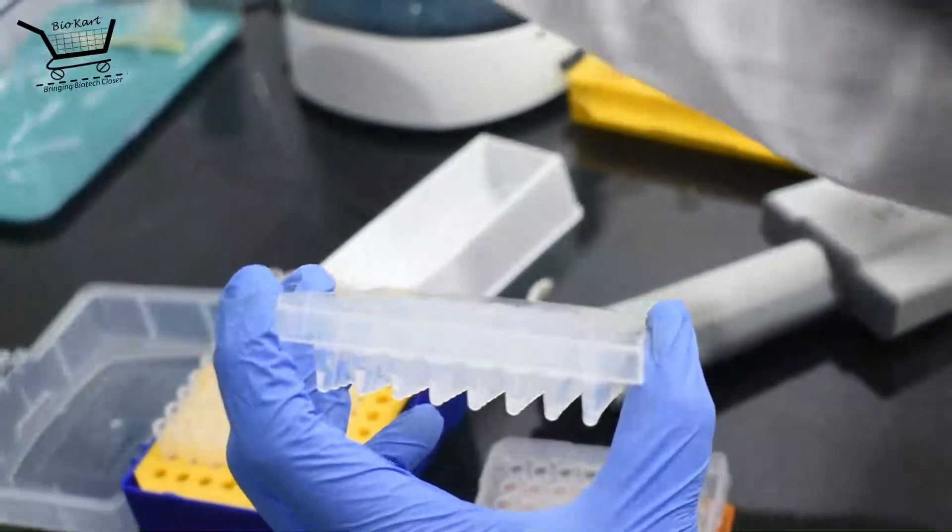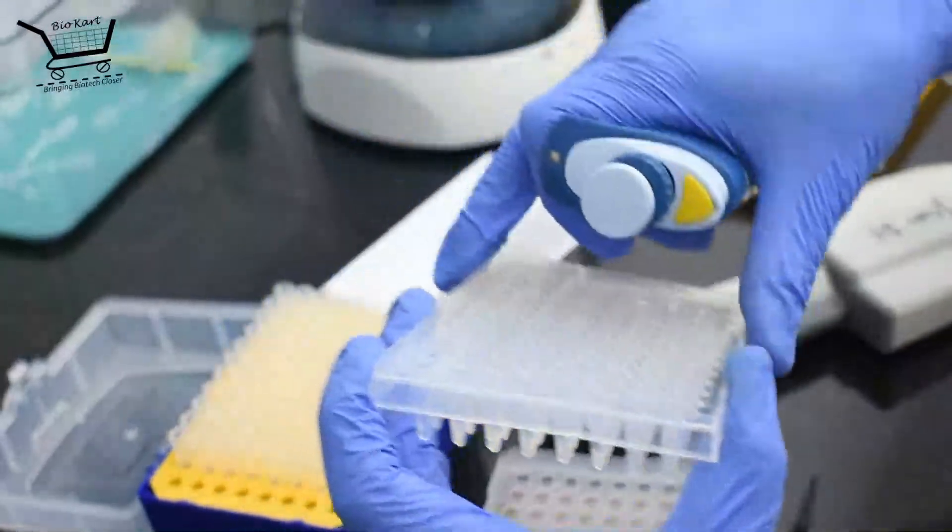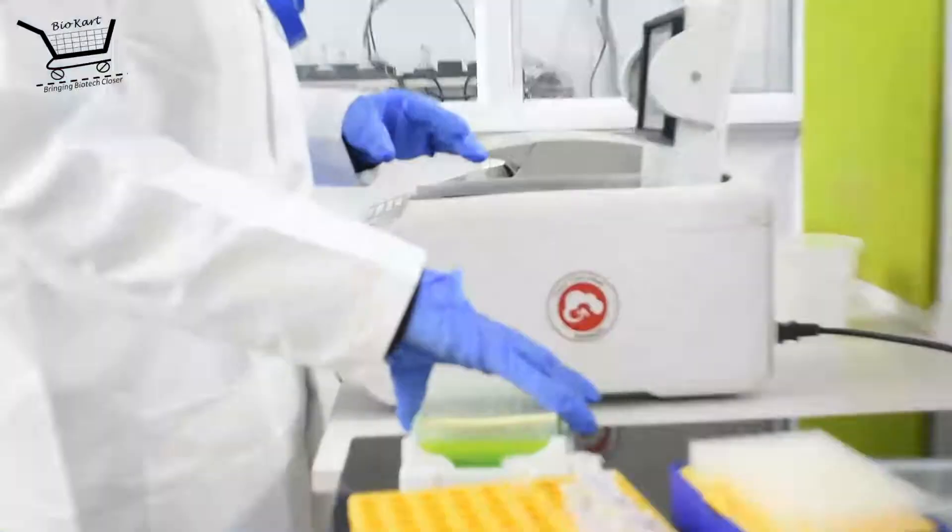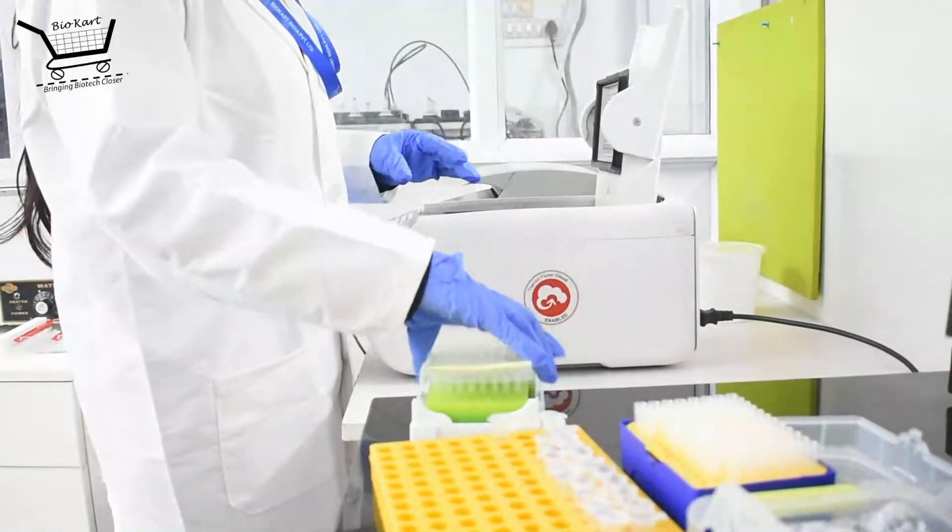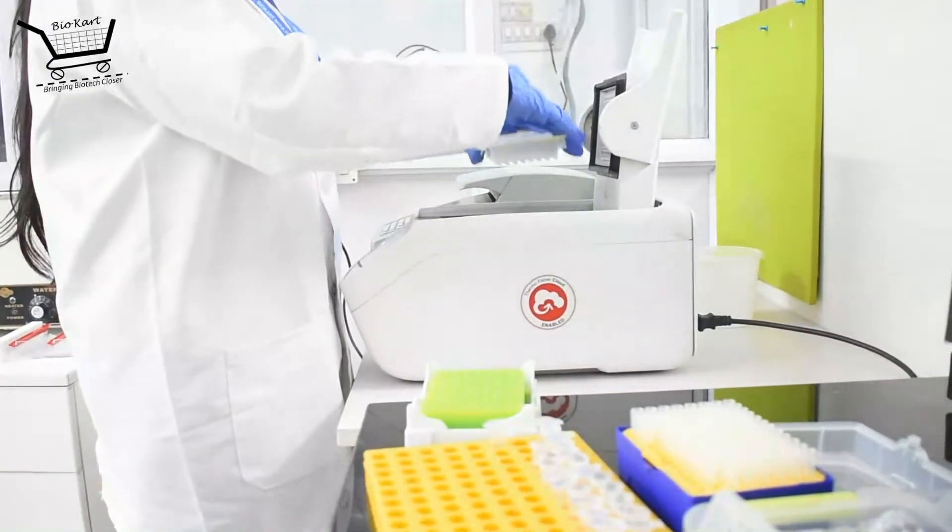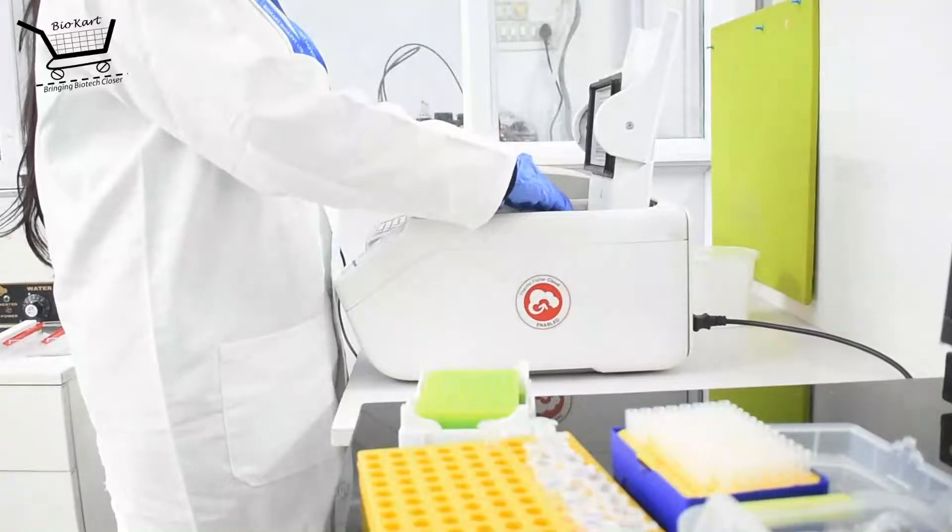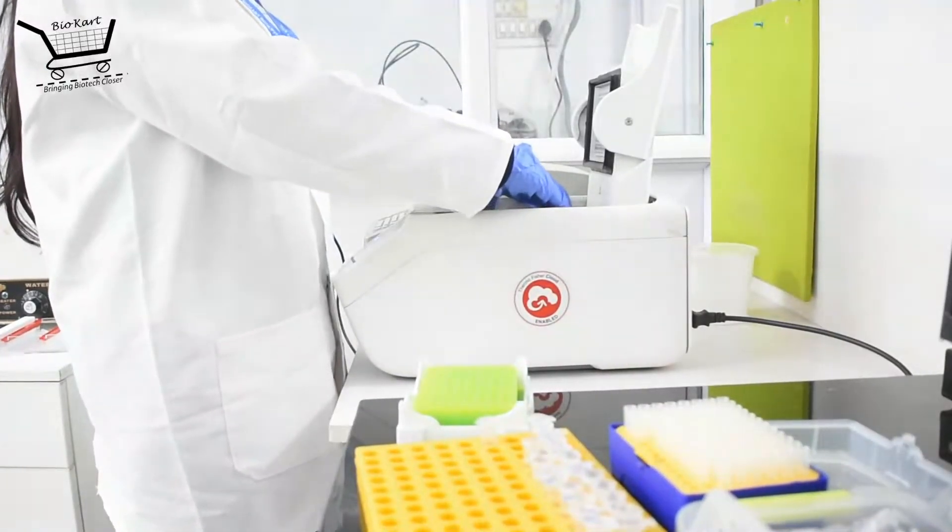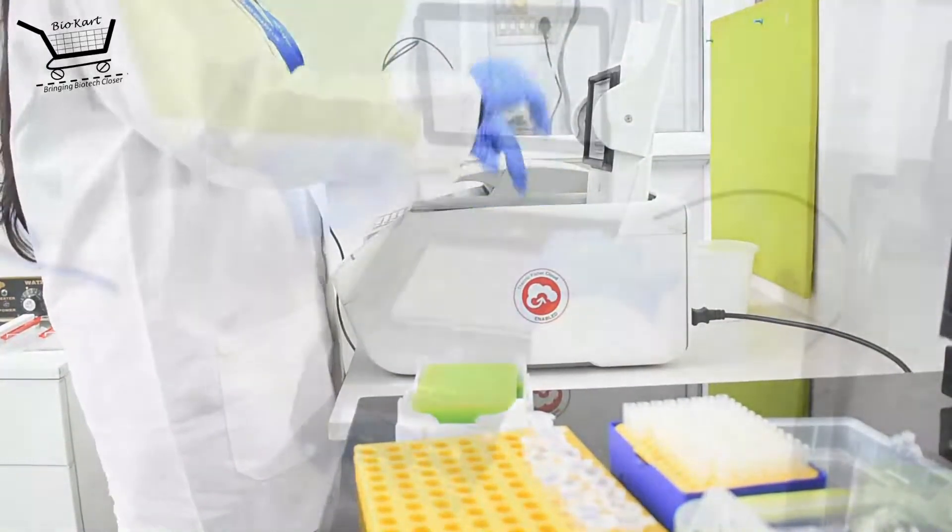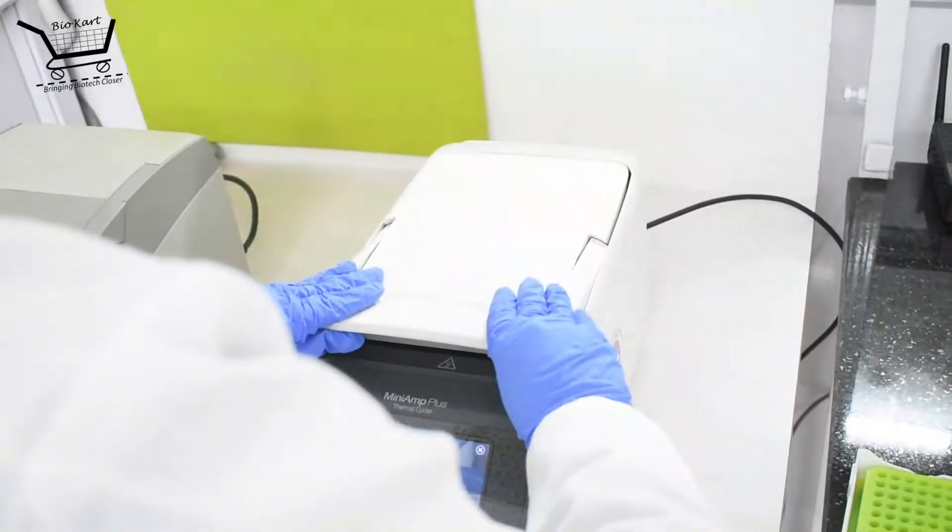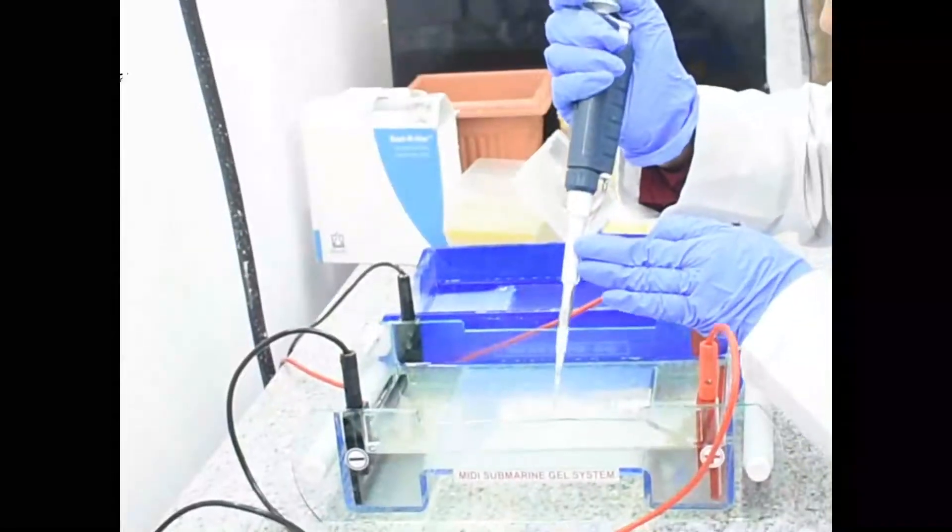Barcoding PCR is the process of incorporation of 8 unique base pair indices to the enriched amplicons. Once the barcoding PCR is completed, another round of QC is done similar to the one performed after the first PCR amplification.